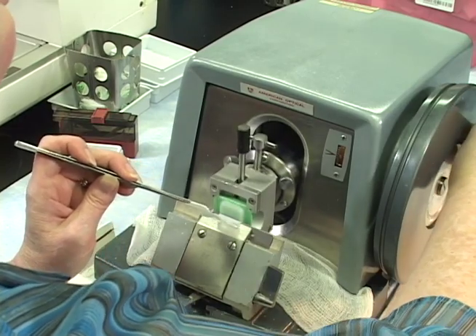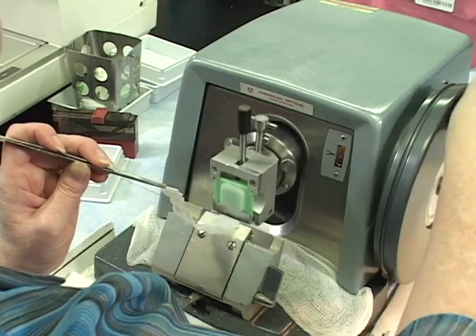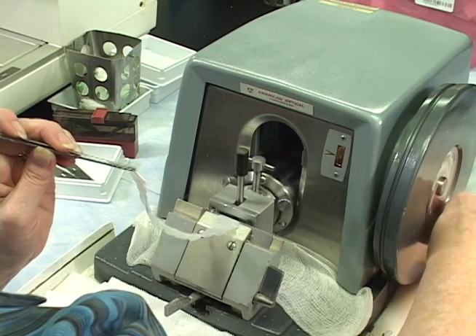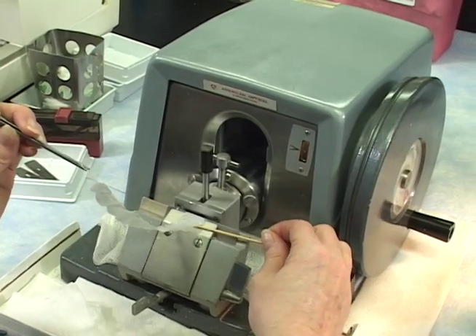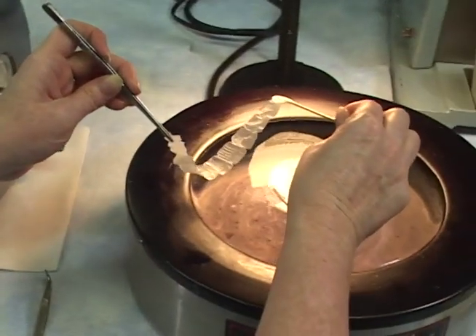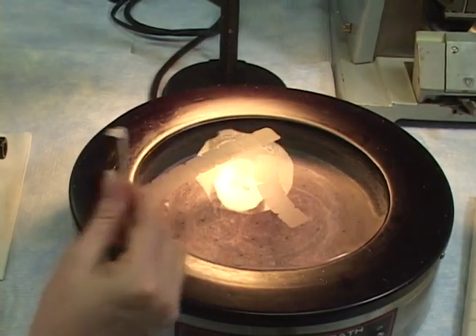And your stroke is everything, and every tissue has its own certain fast or slower stroke that you'll want to do with it. And again, it's giving us a nice ribbon. I moisten the stick. I really don't recommend going more than 5 or 6 sections of tissue. And you've got a nice even ribbon.